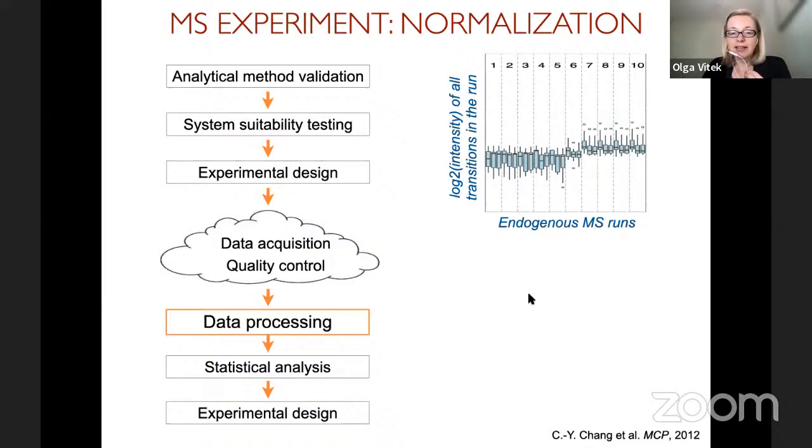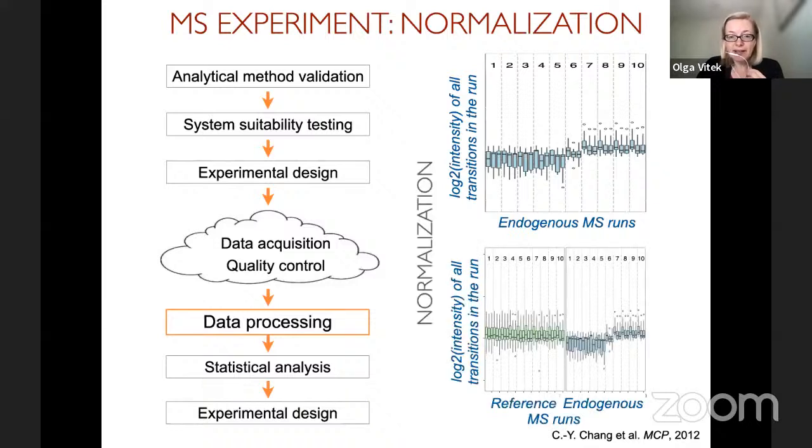Of all the proteins. And so the question is, is this biology or is this technology? And the answer is it can be either, right? It depends on the experiment. So the plot by itself only tells us that the intensity goes up, but we don't necessarily know why. Now, this particular experiment happens to have labeled reference standards. So now I can tell you a little bit more.